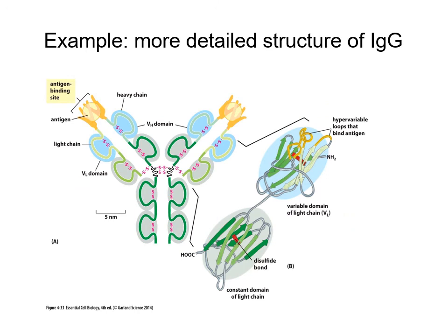So here's a more detailed structure of IgG to see what we're up against. We saw the disulfides that connect the heavy and light chains, but there's also a bunch of disulfides connecting various regions within the molecule. And we've got lots and lots of secondary and tertiary structure, as well as a quaternary structure, which is the binding of the different subunits to each other. So the SDS and dithiothreitol and heat will take care of all that for us in order to make them run properly.